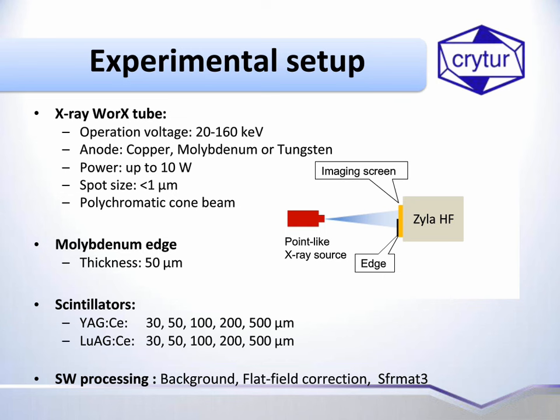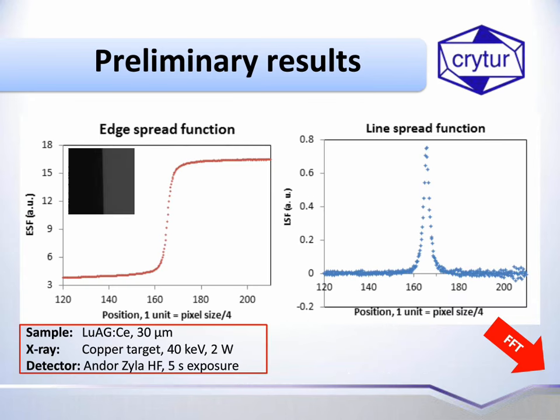After we measured these images, we need to do some processing, which would be background and flat field correction, and then the processing in MATLAB to get the MTF of the system. So let's see, there are some preliminary results.